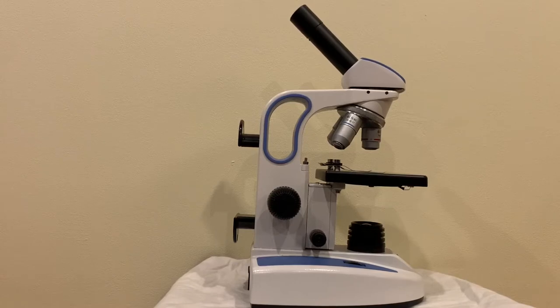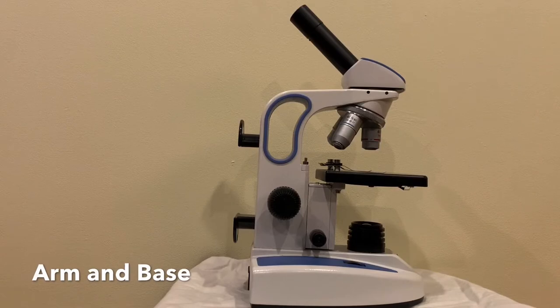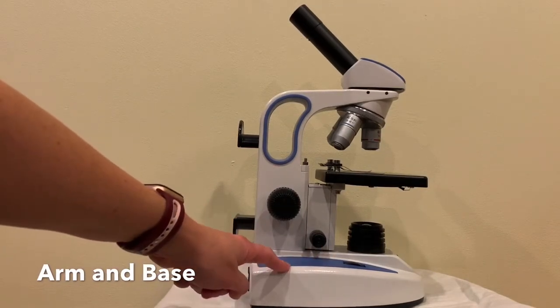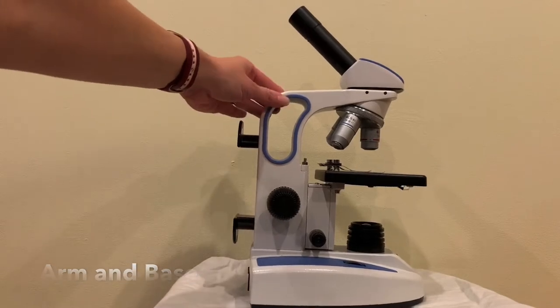Hopefully you recognize some of the parts of this microscope from our previous video on microscopes. So first I'm going to point out the base and the arm.